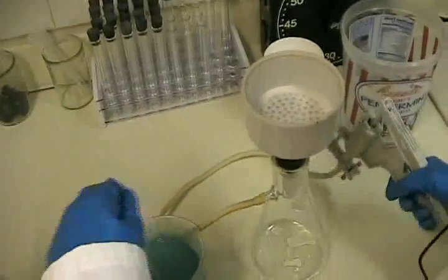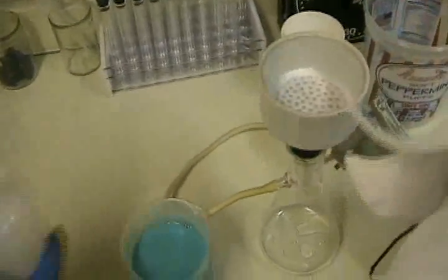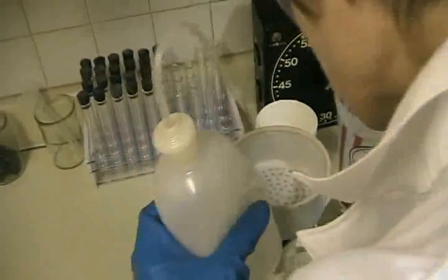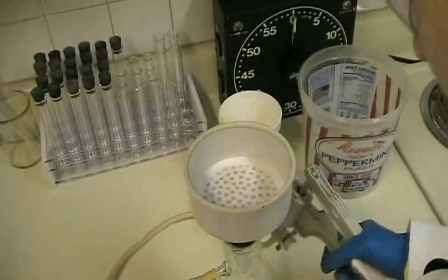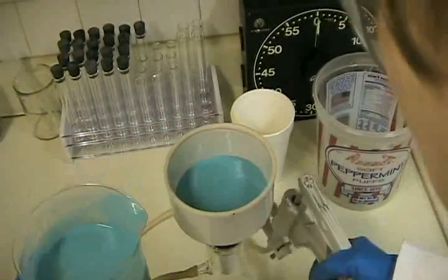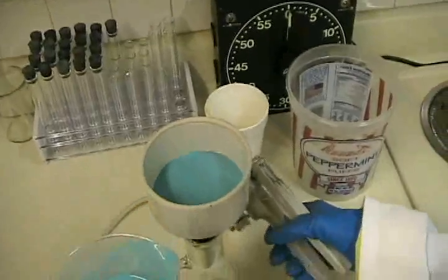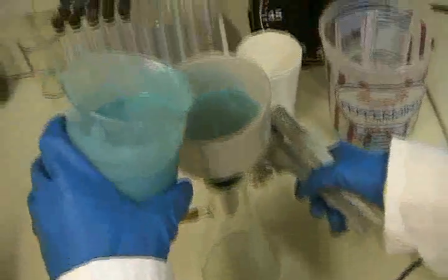You can hear that I'm generating a bit of vacuum. Keep the filter paper moist and make sure all the holes are covered so none of the solution can escape. I'll keep the beaker swirled a little bit so the precipitate doesn't settle, and you can see how quickly this nice little hand pump pulls that liquid right out of the crystals.